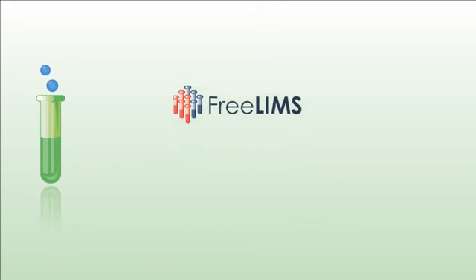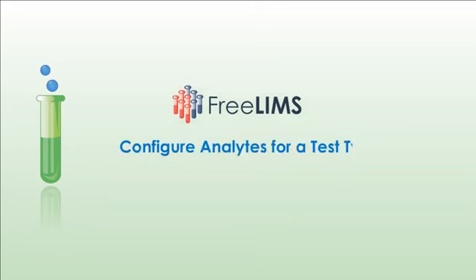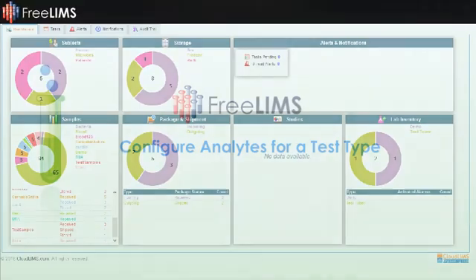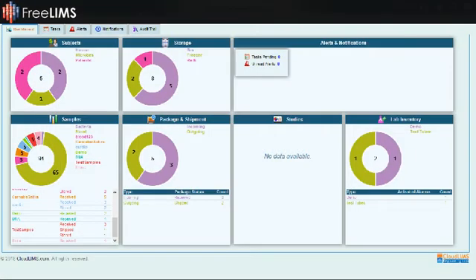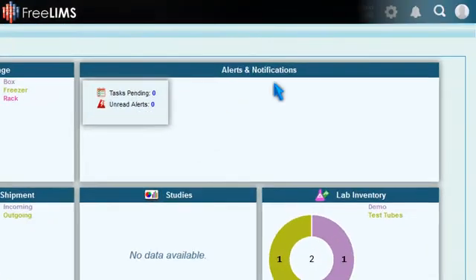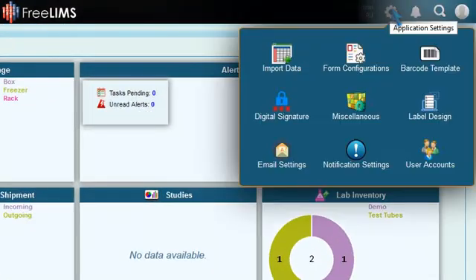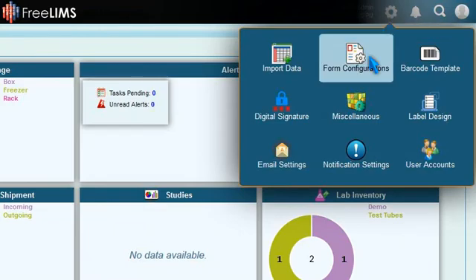In this video, we'll walk you through the process of configuring analytes for a test type. To configure, navigate to the Application Settings module and switch to Test under Form Configurations.